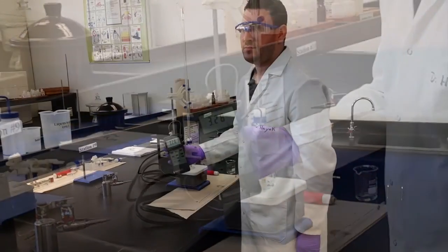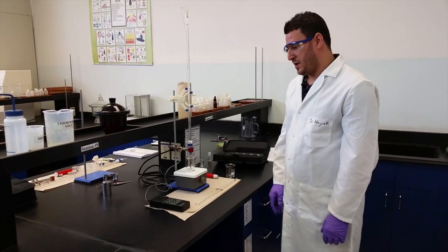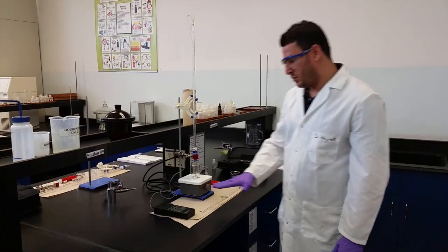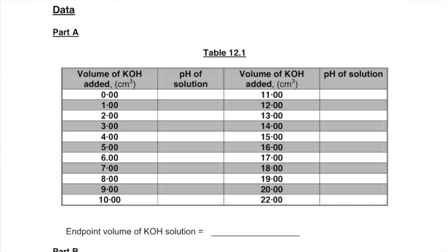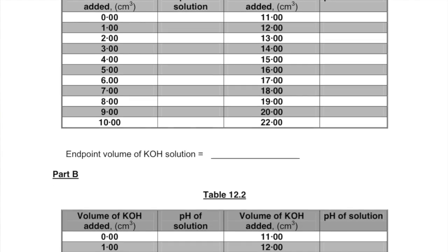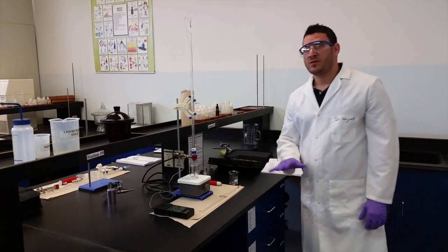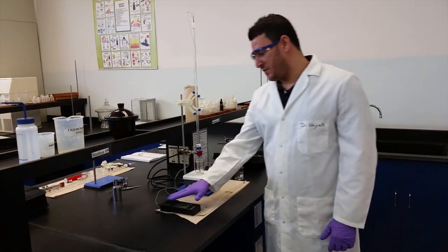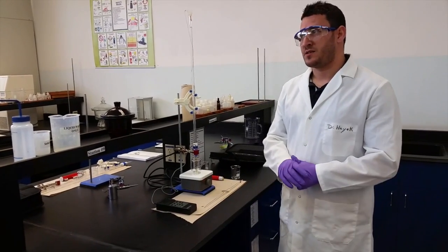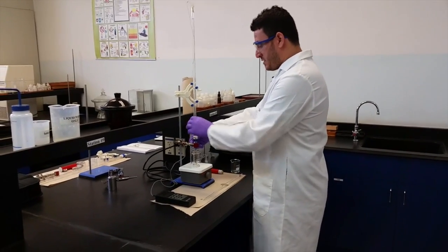Now, as you can see on the pH meter, the pH is 3.3. Okay, so now you will need to wait some time for the pH to stabilize, and then record this data in your table on page 99. And this is when 0 milliliter of potassium hydroxide is added. Once the value on the pH meter is stabilized, it's not fluctuating, you can start your titration.